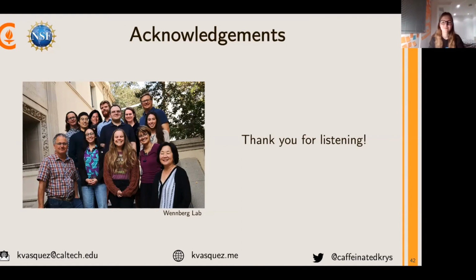We have a question from Susan, who asks whether the column in the GC-MS needs to be cleaned and if that's a problem.